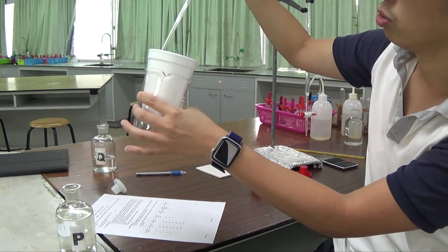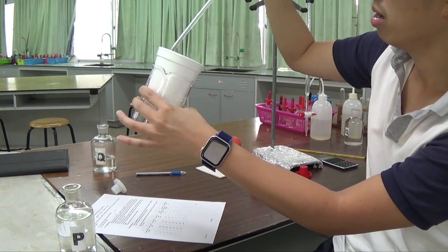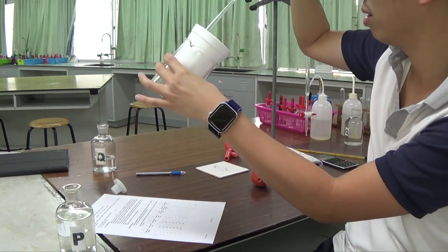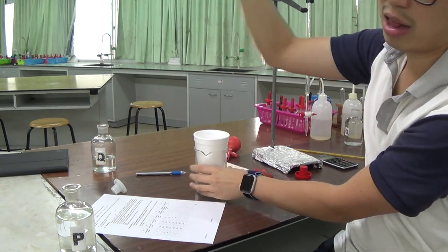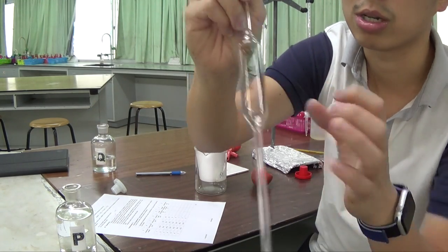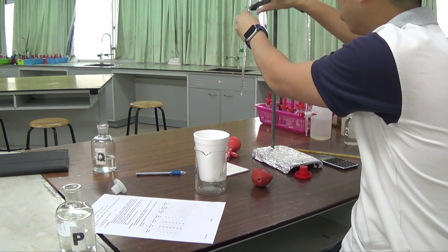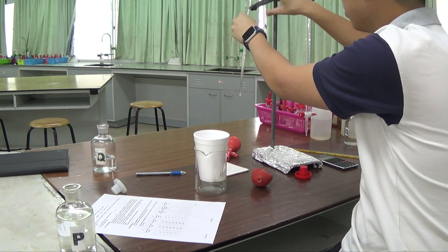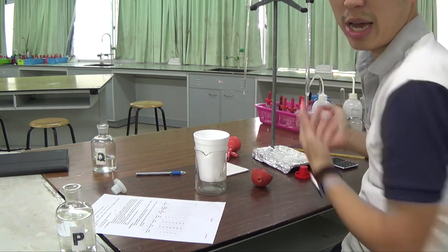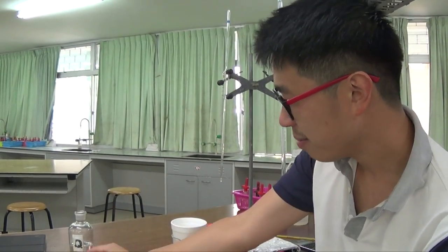This is not the usual on a conical flask, but you can still tip it 3 or 4 times, and then that should get rid of whatever last bit of liquid that's left in there. That's already taken into account by the accuracy of the pipette. Alright, so put your pipette back onto the support. You do not want to break the pipette. Pipette and burette are really expensive stuff, okay?